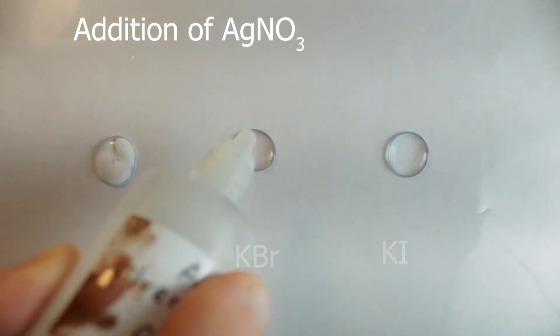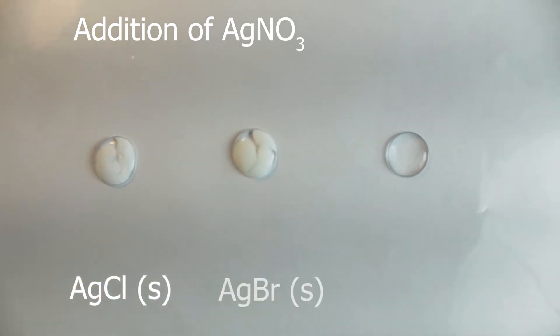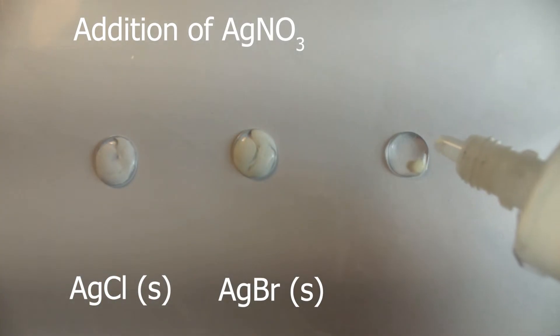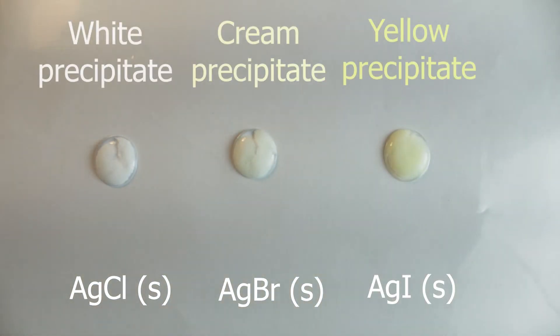On addition of silver nitrate, you can see the precipitates color. Silver chloride white, silver bromide creamy, and silver iodide yellow.